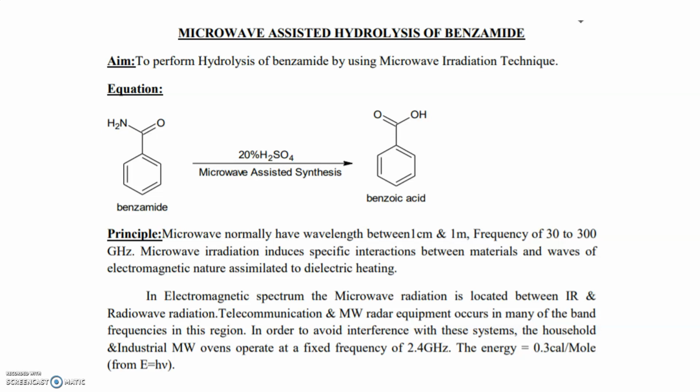Today in this video, I am going to discuss a chemistry practical, and the practical is microwave assisted hydrolysis of benzamide.